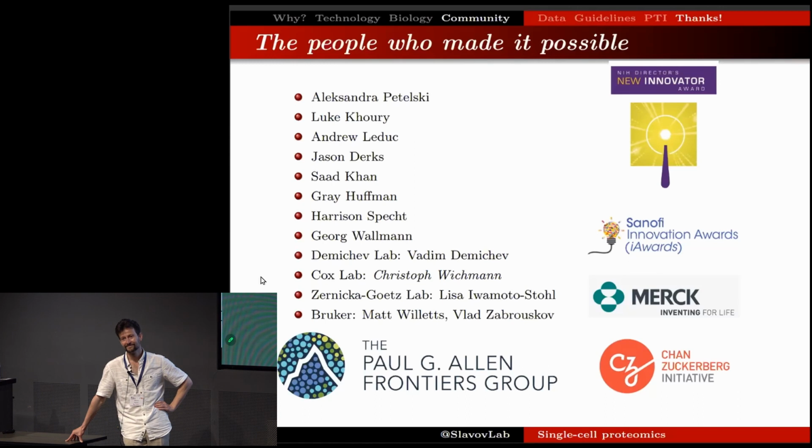That's still quite impressive. And what would be the scope of targeted proteomics, MRM or PRM, at single cell level? That's not a strategy that appears particularly competitive to me, because of the very low number of precursors that are analyzed that way.